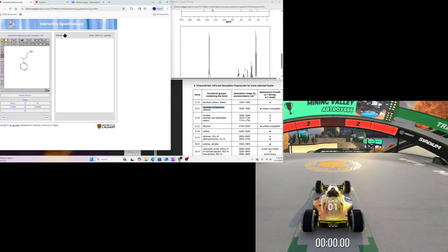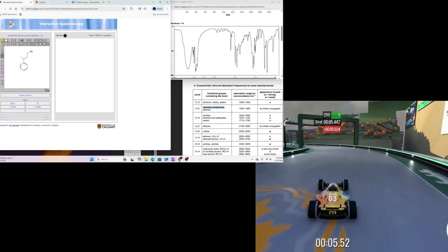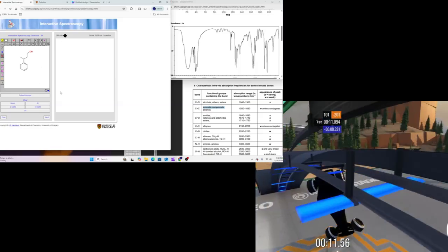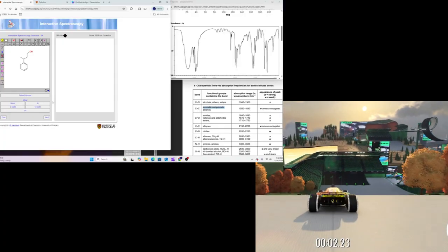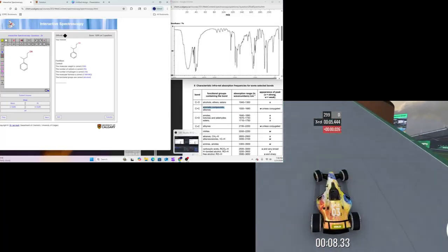Again, for the most part, I'm more concerned with you getting specifically what the functional group is that we're looking at and being able to answer the questions from there. This one was a little bit more difficult, but our same process for finding the functional group and everything else is the same. So at this point, go ahead, take your time, work on those questions there, and good luck.